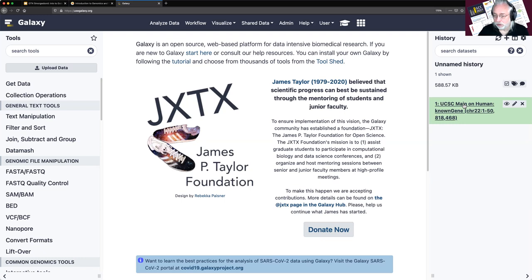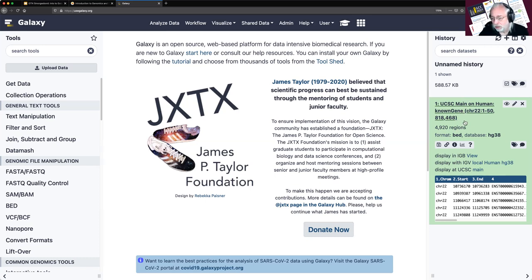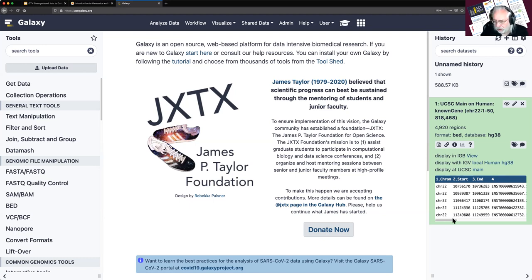We got our data — let's take a look at it. I click on the name and it opens up showing some facts. We have almost 5,000 regions — that might mean genes. So we got almost 5,000 genes on chromosome 22. The format is BED, and the database is HG38, which is the build from 2013 that we picked in UCSC. And there's a short preview of the dataset showing the first five records and columns.